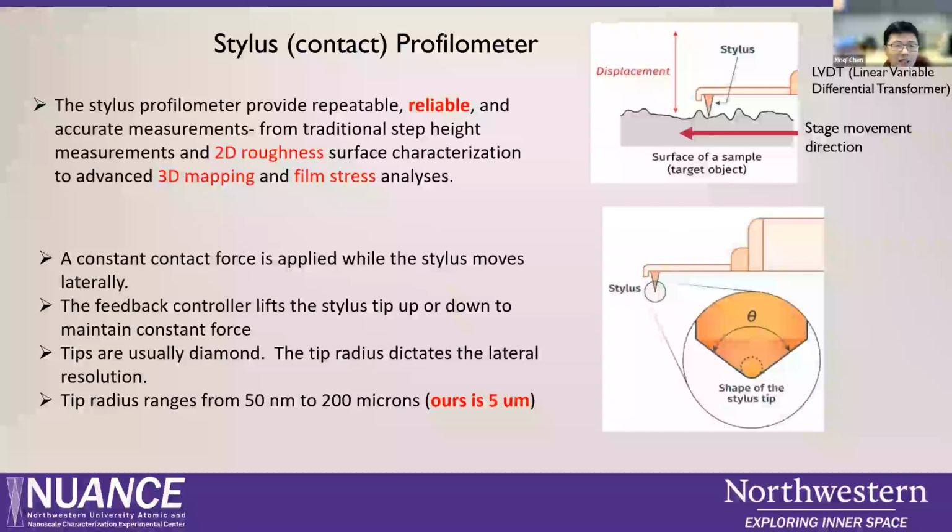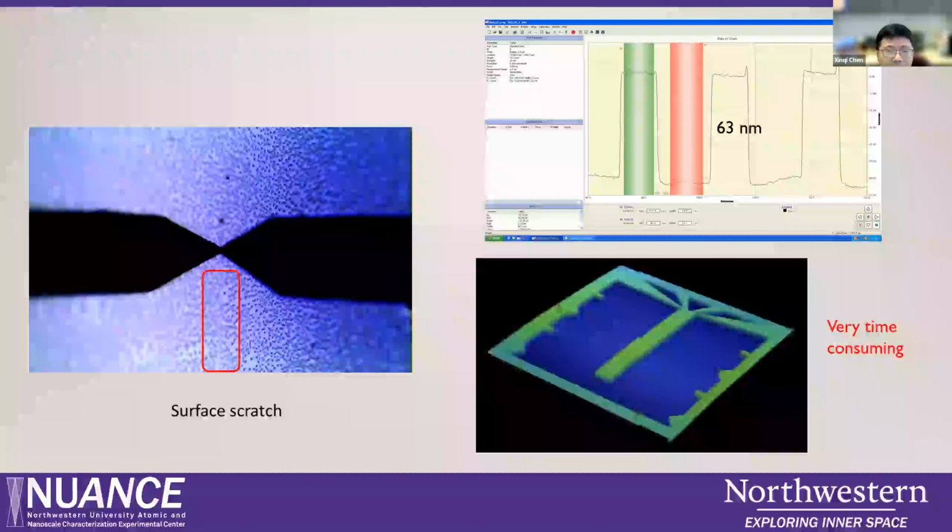Let's see the next slide. Here on the right, you can see the profile along the line. This is a 63 nanometer step height. On the left lower corner, they basically give you this step height information. And here you get 2 bars, and I also expanded these 2 bars. This is an advantage: you can get an average. You can use a narrow bar, which may vary by the roughness there, and then you can average them.